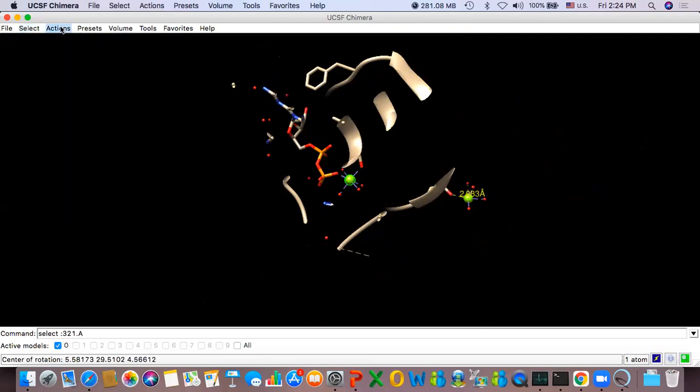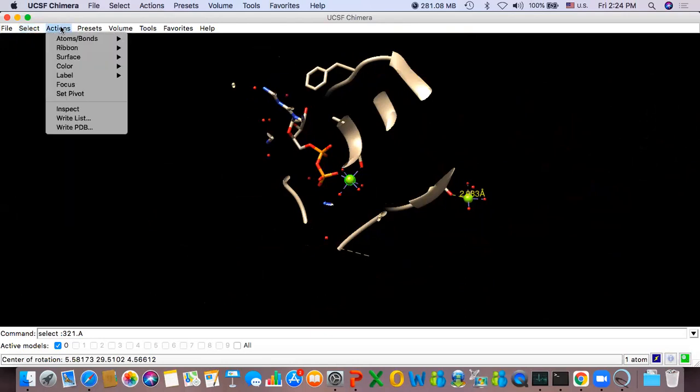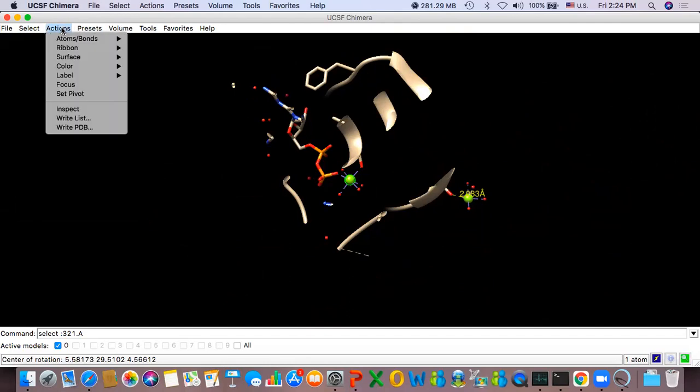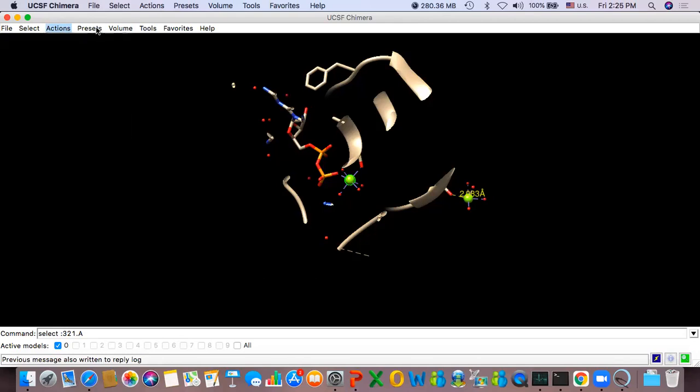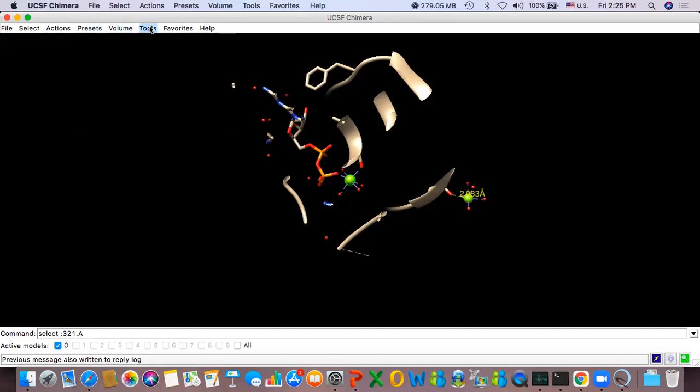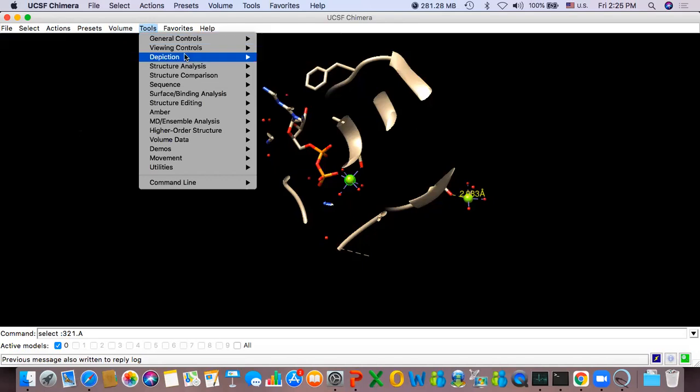Sir, once we do any operation on Chimera, how do we undo it? For instance, we set the pivot, now we have to remove it. How do we approach that? It used to be that you change the view and it goes away. I'm just trying to see, sometimes it goes away. Just a minute, I'll tell you. You can get rid of it in various other ways, but I'm just trying to see in the options whether you can.